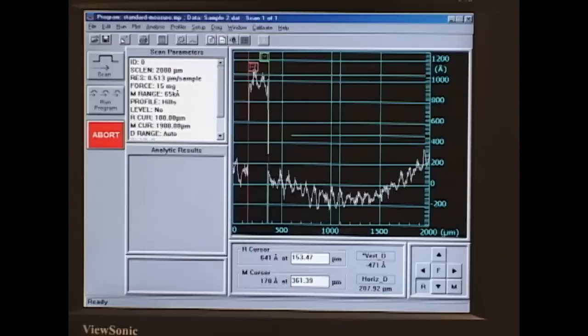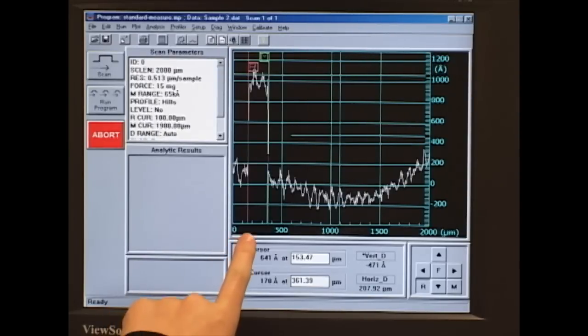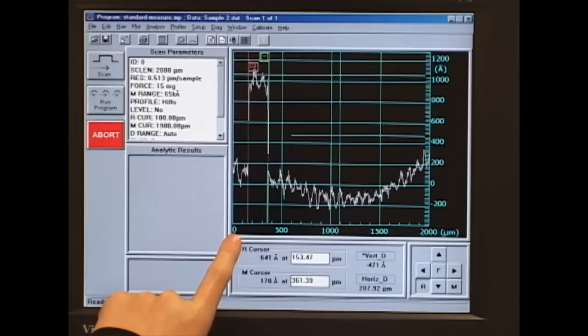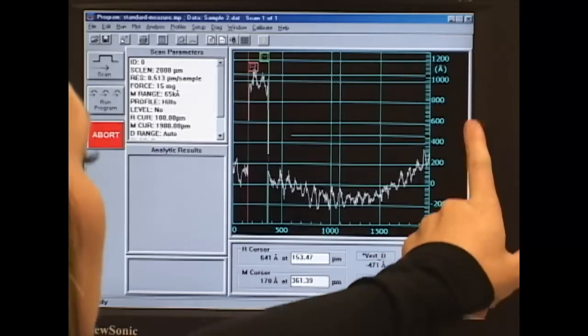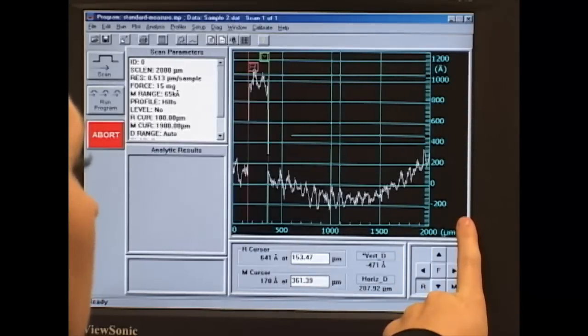So something to note about this instrument, it measures very small features. So while you have a scale of microns that goes in the horizontal direction of your sample, the vertical direction of your sample will be on the scale of angstroms.